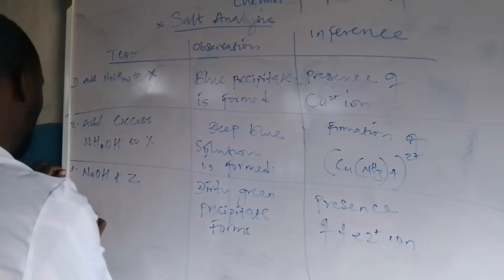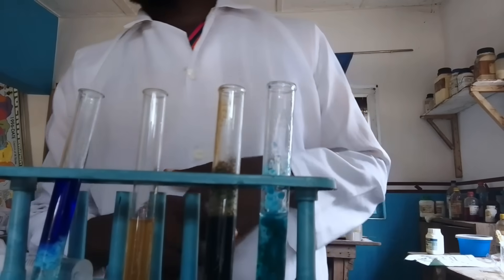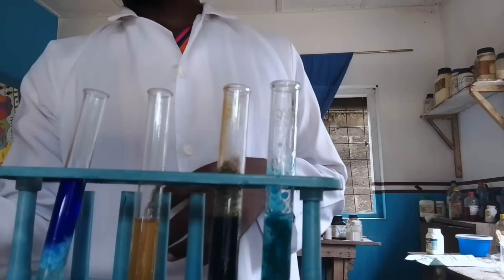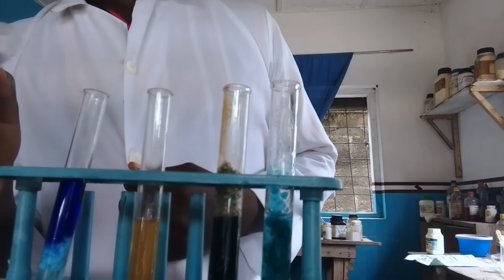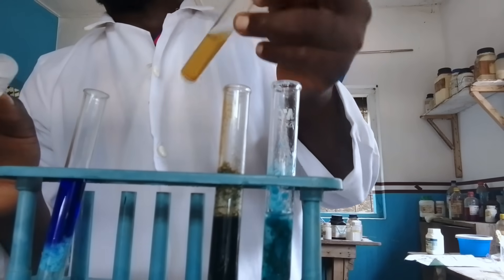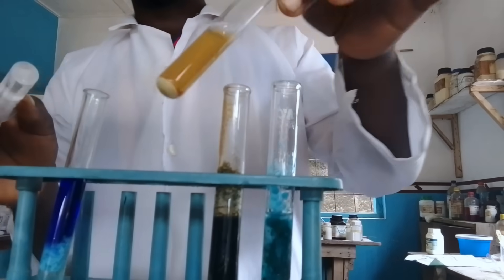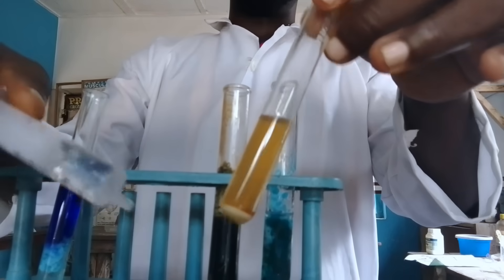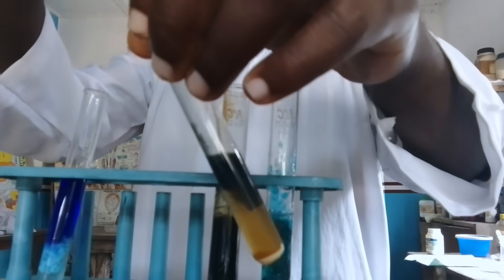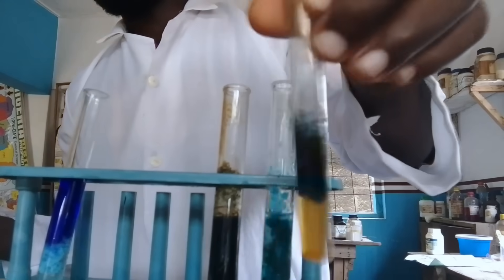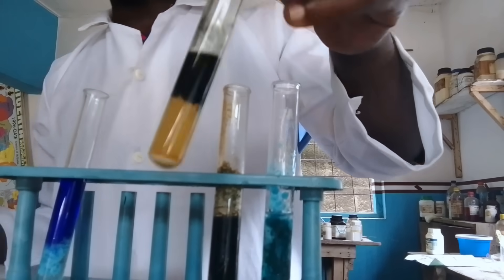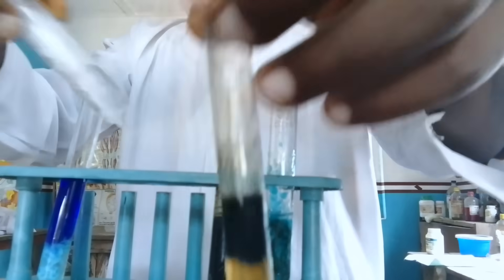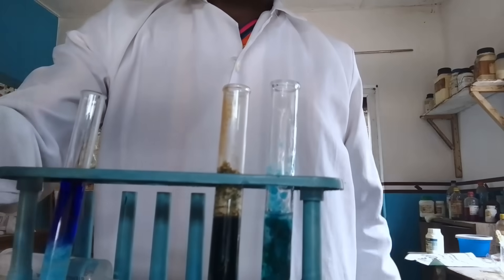Now let's go over to the fourth test. We are going to be adding ammonium hydroxide to the iron sulfate solution.